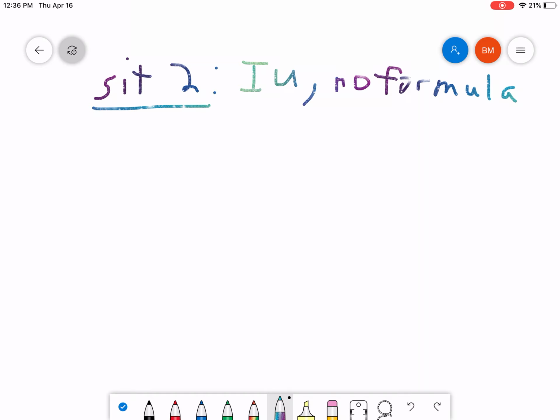So let's look at the previous one that I just did, except let's pretend that we did not know the formula. There is a way to do this. It's a little bit rougher, but it still usually works. So we don't know the formula. We do know that A to B to C has a ratio of 54 to 23 to 33 via integration units.